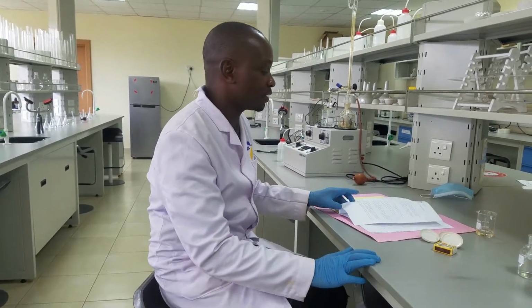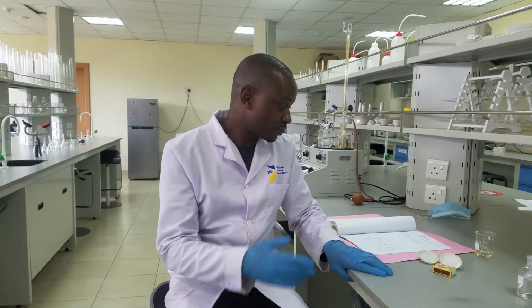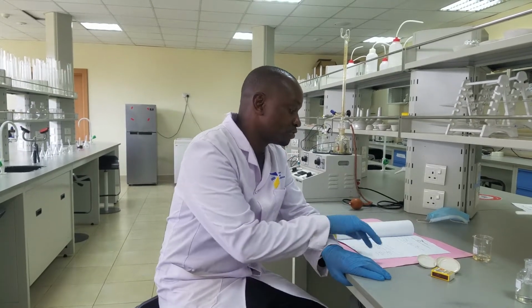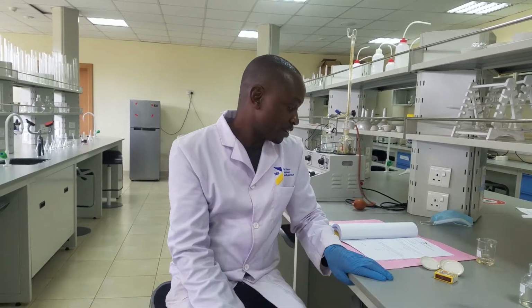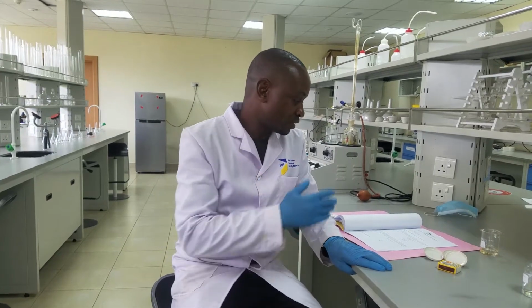combustibility. When you burn hydrocarbons, they produce a lot of soot because of the carbon and hydrogen ratios. So you can identify a hydrocarbon by the nature of the fumes that come out during combustion, and so we will do that test also. I've told you combustion, DCM, and water. After that, we'll also test aldehydes, ketones, and acid anhydrides using other methods, which my partner, Eugene, will do in the next part.